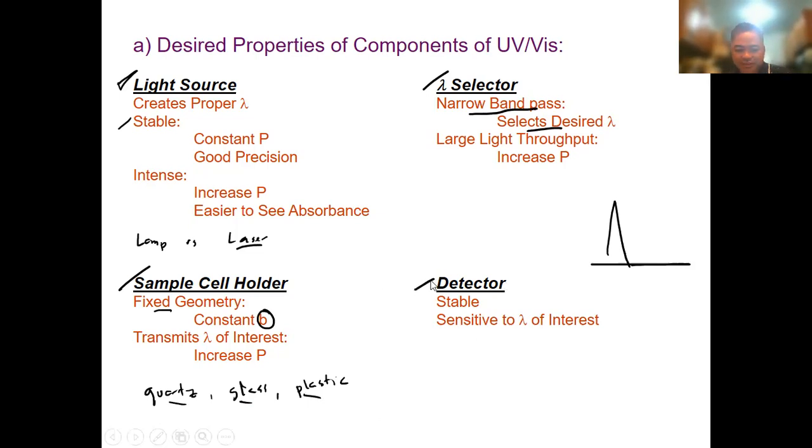the fourth one, we have what we call the detector. Okay? So usually, yung detector na yan yung tinatawag nating transducer. So it can be a phototube, it can be a photomultiplier, yung PMT, it can be a photodiode array. So usually, yung photodiode array, it's a multi-channel photon transducer. So you can have the charge transfer device, the charge injection devices, or the charge coupled devices. Okay. I think that's one of the questions in your exam, right? Tama ba ako? Or baka sa ibang course yun binigay ko? Sa infrared, usually yung thermal transducers yung ginagamit dyan. But for now, we stick with this one.